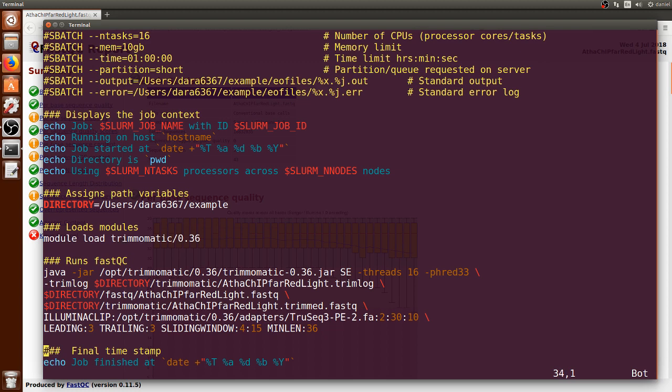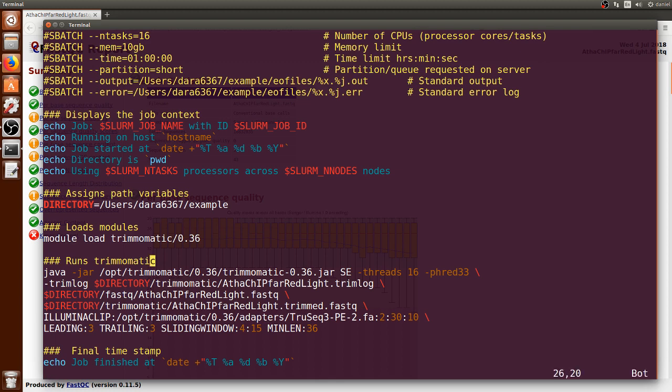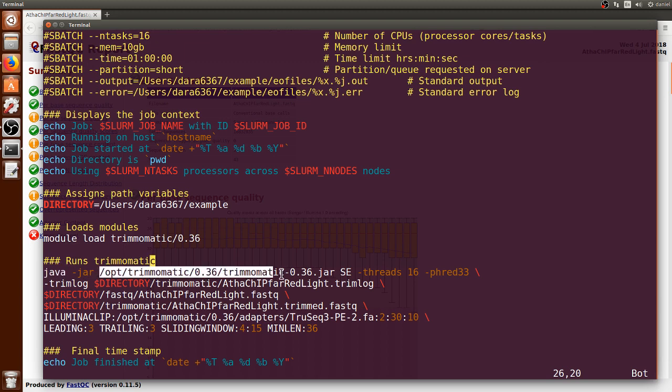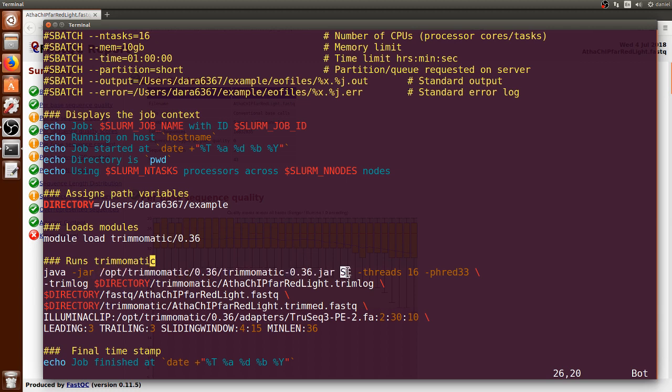This is a typo here. We can press the letter I to go into insert mode and change this from FastQC to Trimmomatic, just to have better documentation of the sbatch file. To run Trimmomatic, we will have to first summon Java. We do it this way, and then we have to put the specific path where Trimmomatic lives on the computer cluster.